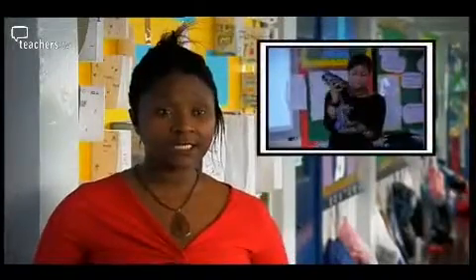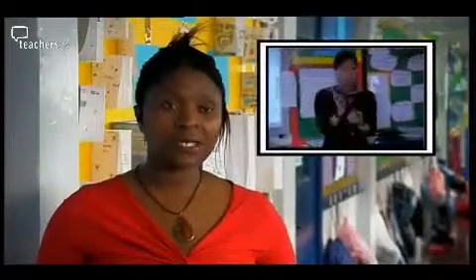I thought the very beginning part of the first lesson worked really well. I liked the way she'd used a physical microscope to actually describe and to explain to the children exactly what they were doing, and having the physical microscope actually helped them to focus on exactly what they were going to do. If I was to do the lesson again, I'd allow the children to actually physically hold the microscope and just play around with the magnification, because it's quite sturdy, so they can actually hold it and just pass it around and see in a bit more detail.